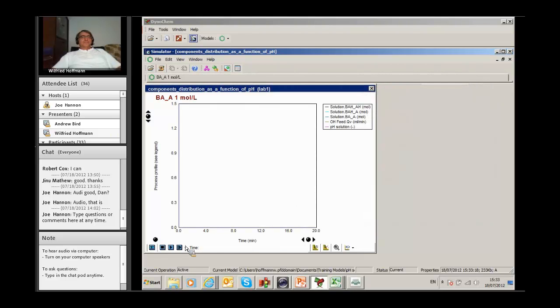I will first probably close the other models here, that's too much at the moment. So you see this, and what I will do is, because we want to use these values, I run this reaction with quite good screen resolution or data point resolution, not 50 points maybe 500. Then we run this and what you see here are the species. You see straight lines interestingly. This is the compound where everything is protonated, and then we increase the base and the protonation will be gone. That is the species where only the benzylamine is protonated but the aniline is already free base, and then at the end you see that is the full free base where both nitrogens are in the free base state.